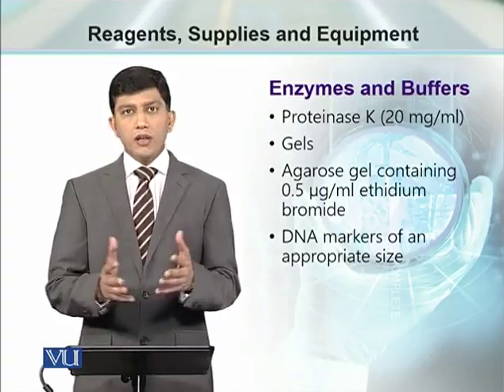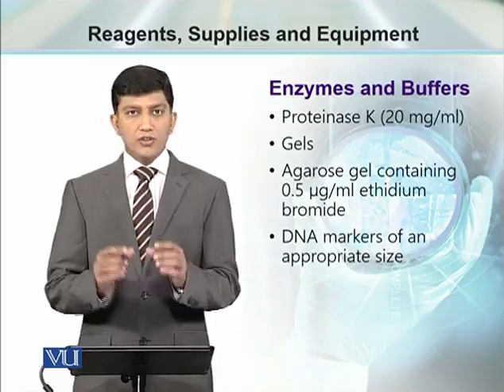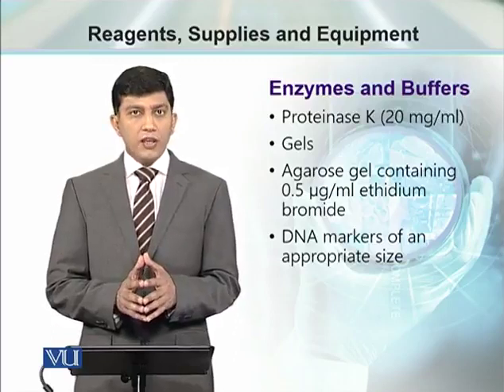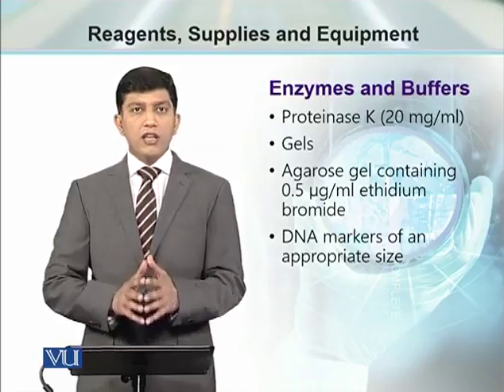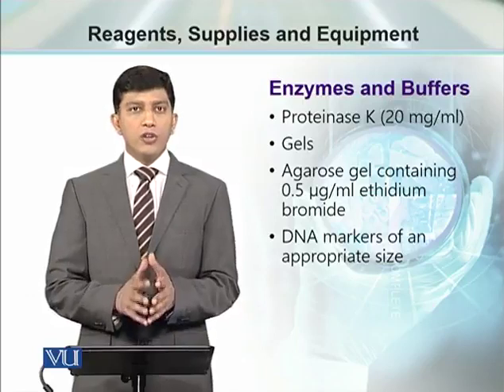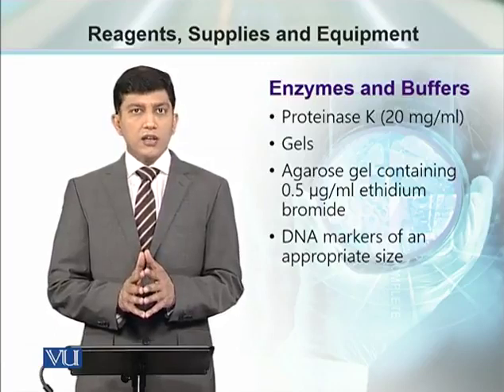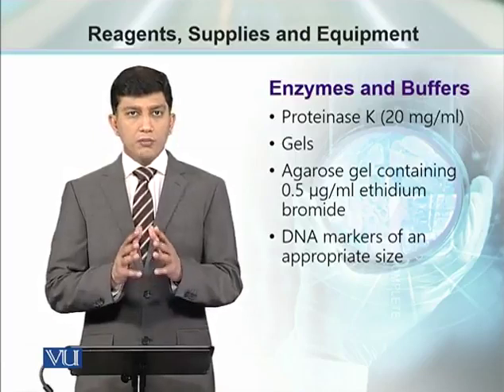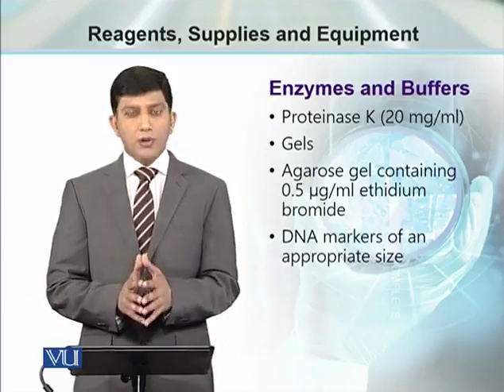And once you dissolve it, you make it a solution, it should be stored in the form of aliquots, small volumes, and then it can be used for purification of the DNA. The purpose of using ammonium acetate in the presence of ethanol is that the non-incorporated dNTPs from the PCR mixture can be isolated without disturbing the amplified product.